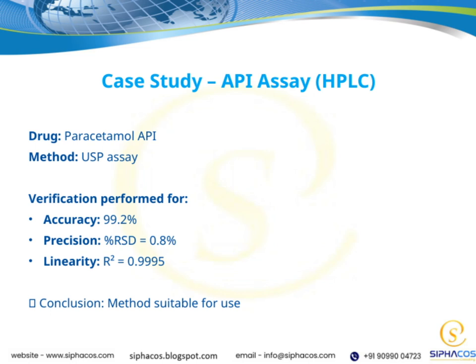This high accuracy indicates that our method reliably measures the actual amount of paracetamol API present. Next is precision, which assesses the consistency of our results. The %RSD, or relative standard deviation, was only 0.8%. That's a very low variation, showing our method produces reproducible results across multiple tests.